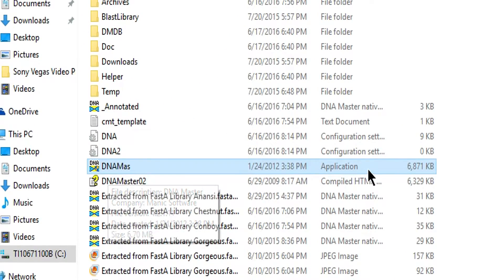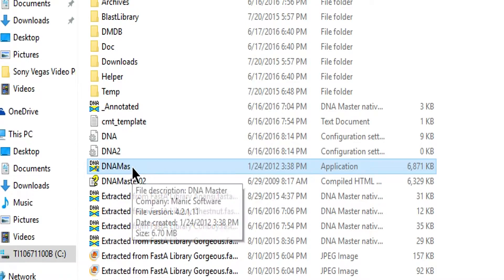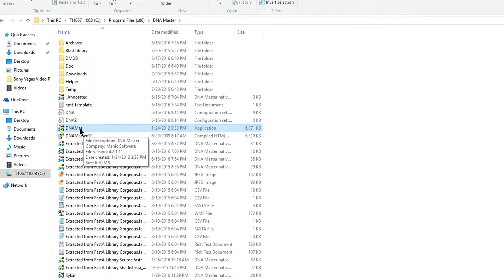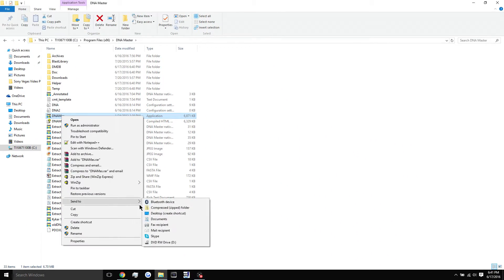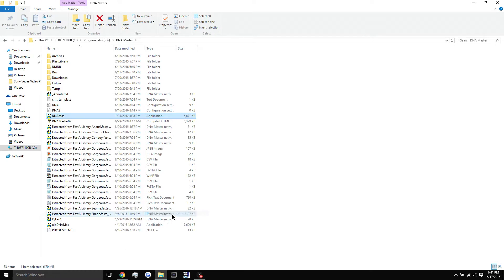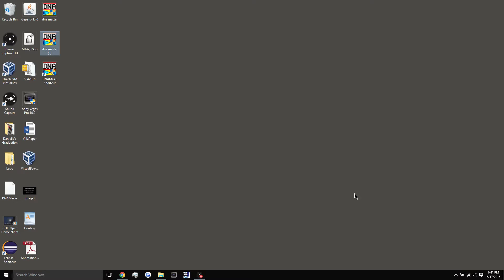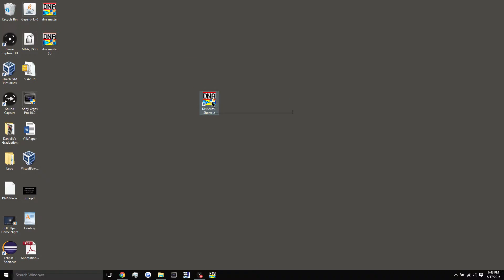This is it right here. It's called DNA mass. It's an application type. So it's dot exe. You want to right click on it and hit send to desktop, and that will create a shortcut for your program right here.